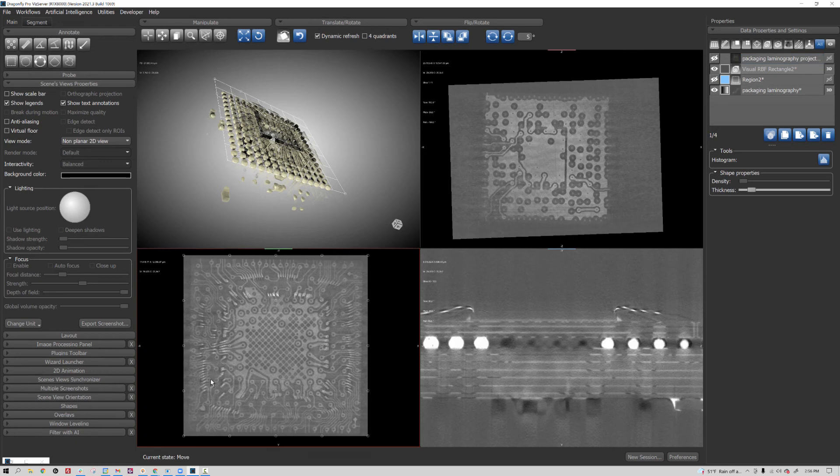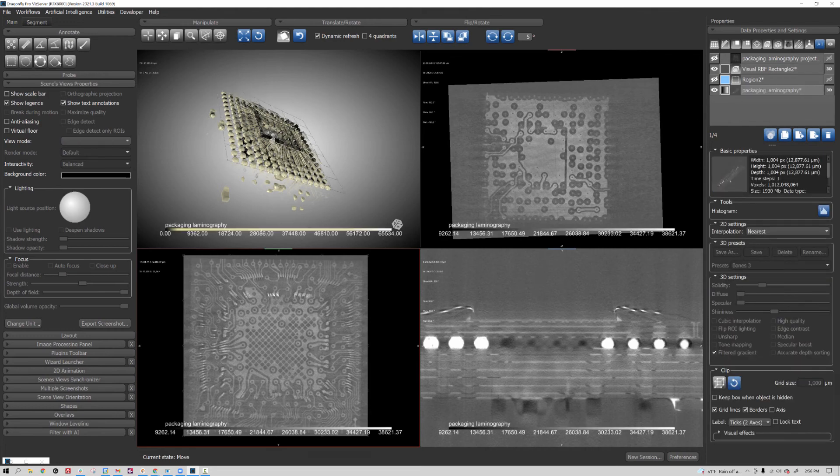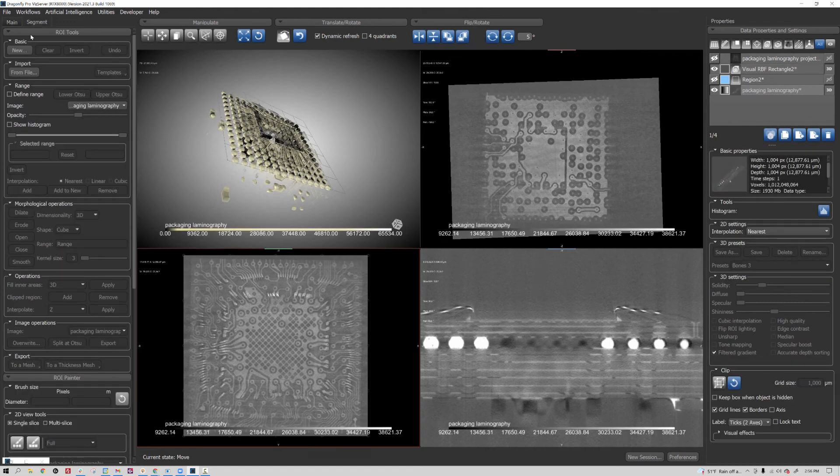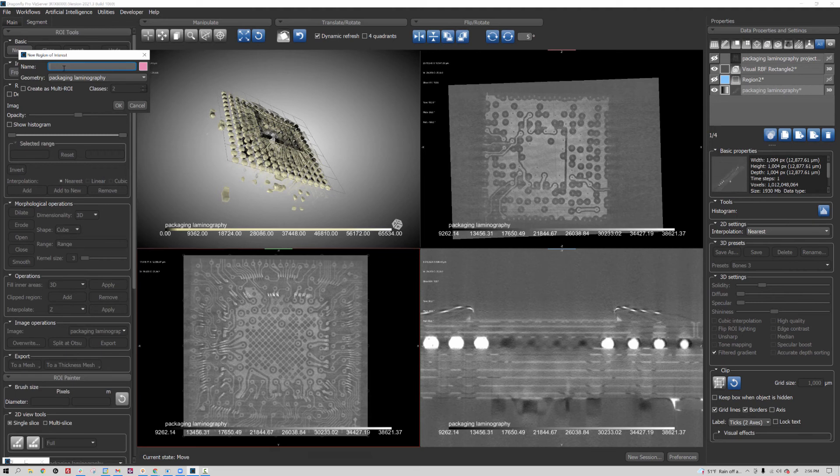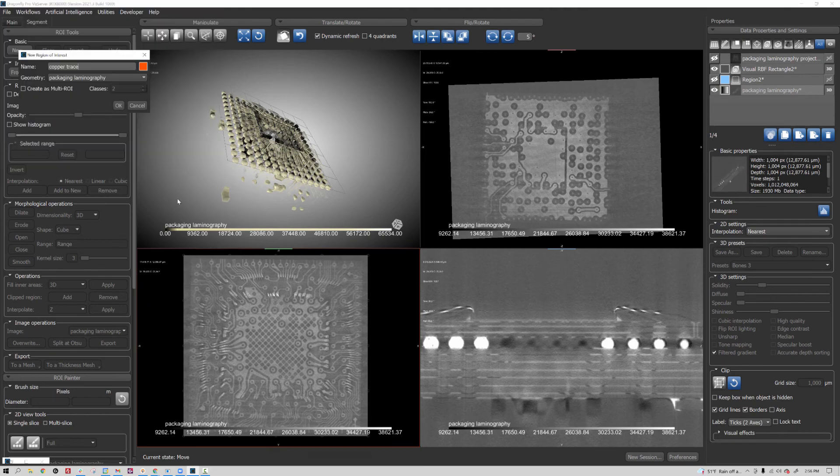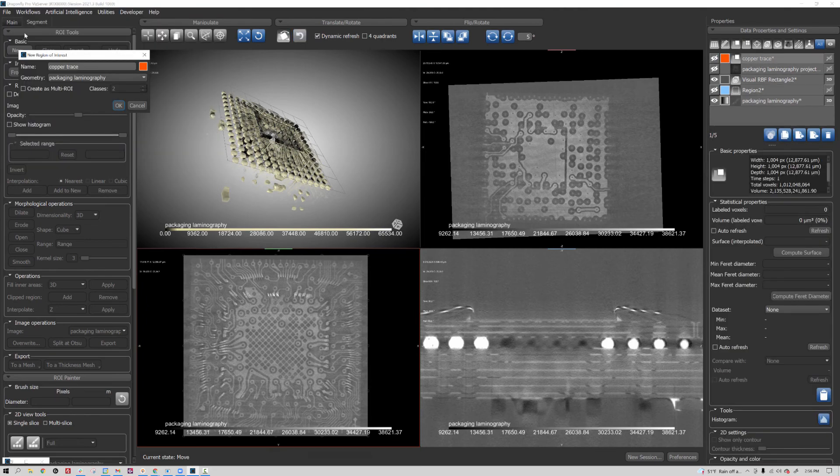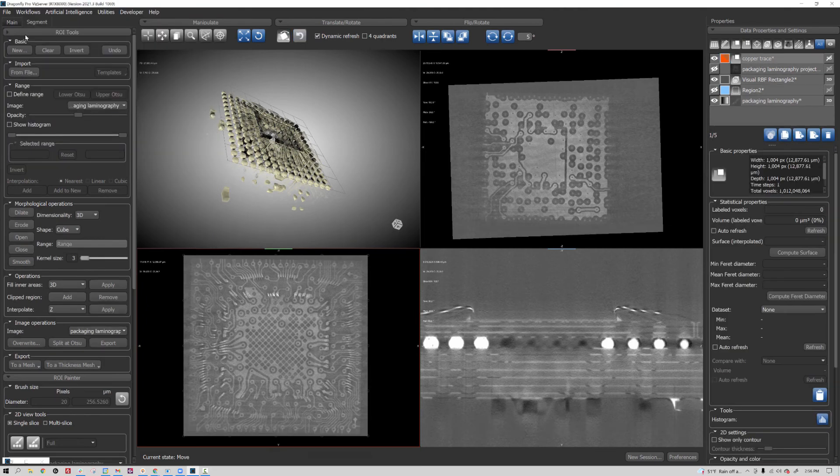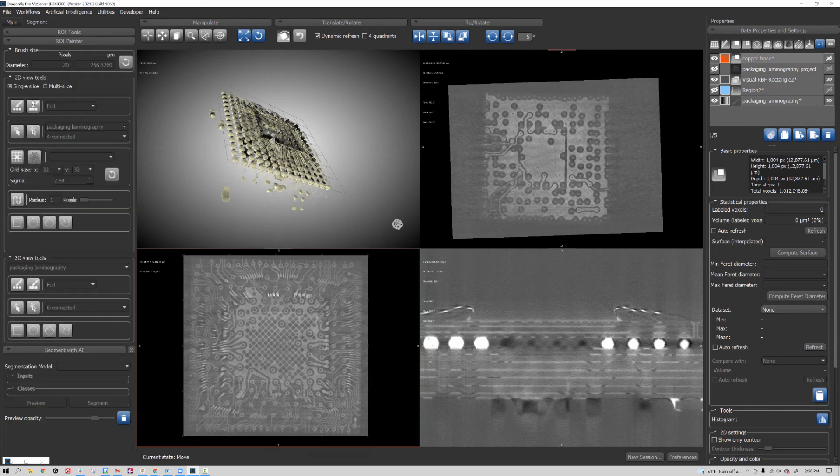I should also note that you can segment in this space. So if I have my initial CT scan and I create a region of interest—I'll call this copper trace and give it some color—and now I can come down here and use the ROI painter tool.